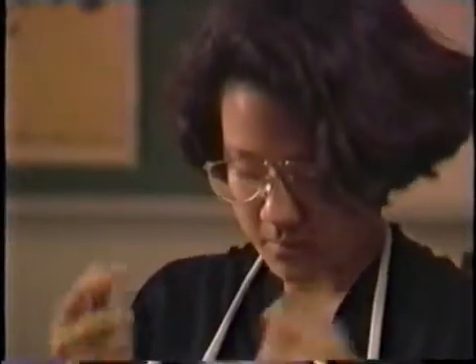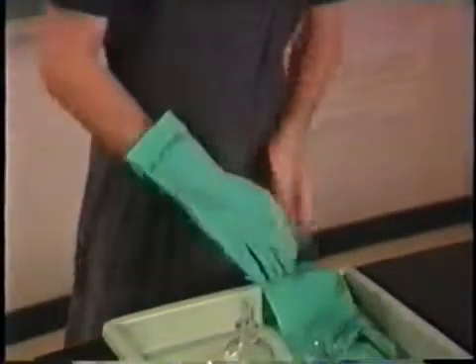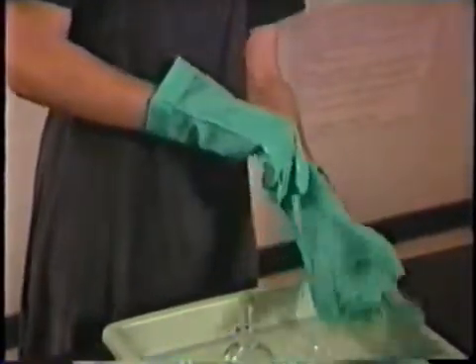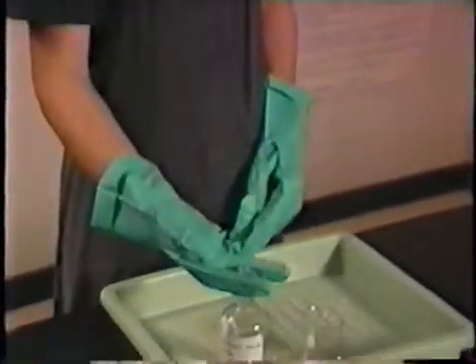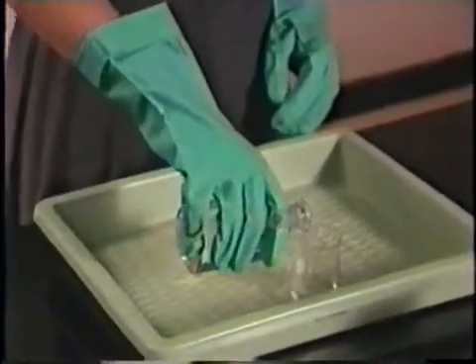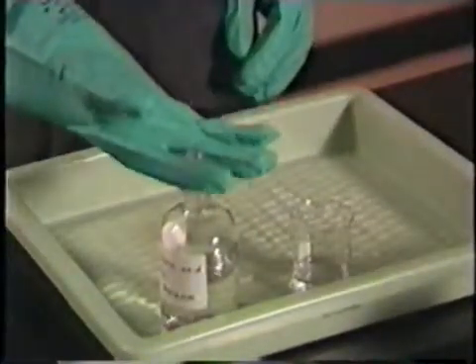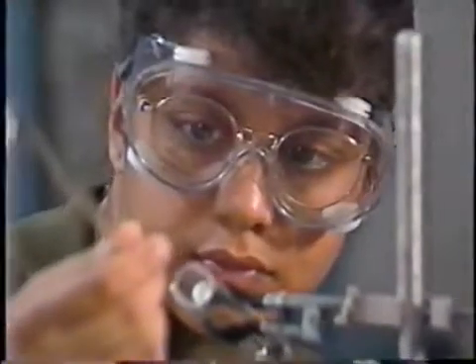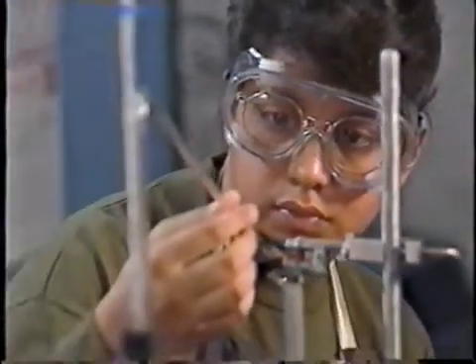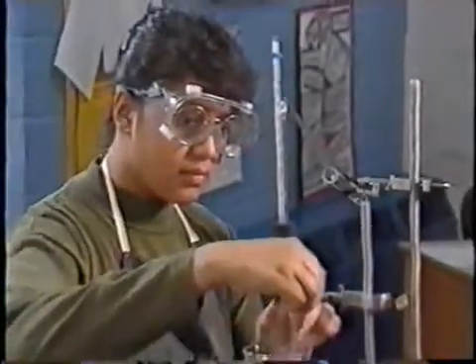Always wear goggles with side shields to completely protect your eyes, even if you're already wearing glasses. Finally, protect your hands — never use bare hands with concentrated acids, bases, or other reactive chemicals such as concentrated hydrogen peroxide. Your teacher will tell you what type of gloves to wear to work with these chemicals. With the right clothes and protective equipment, you can work with laboratory chemicals with confidence and safety.